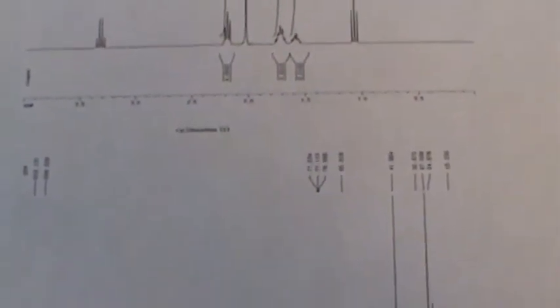So go over here. Now, again, on this day, they didn't set their reference quite great, so you're going to see these 2, and you're going to laugh at the numbers. You got 206.9s, 207 and 212. So which one is acetone and which one's our product? Here, not 100% sure, but you can clearly see how this is a typical thing you'll see at lower resolution.